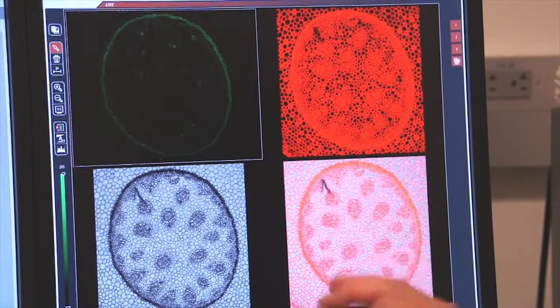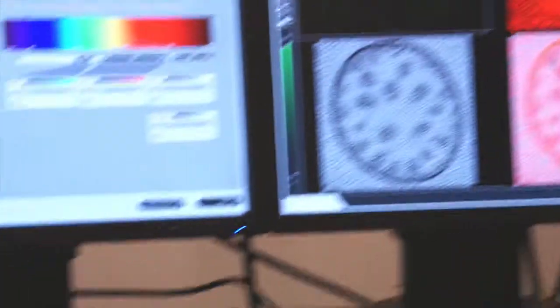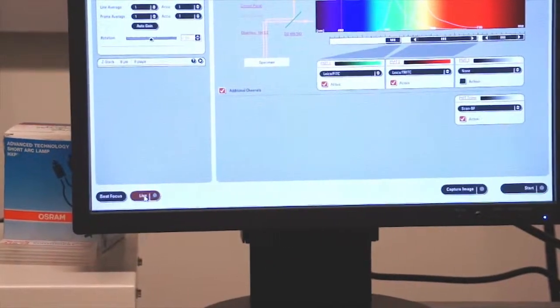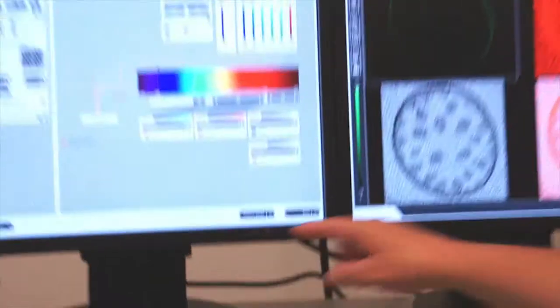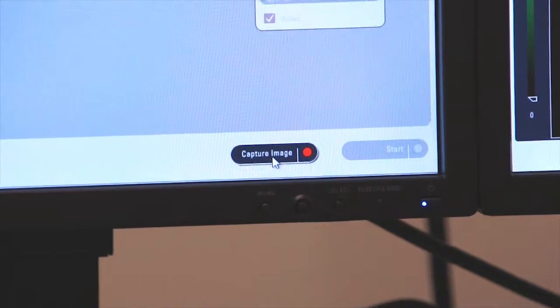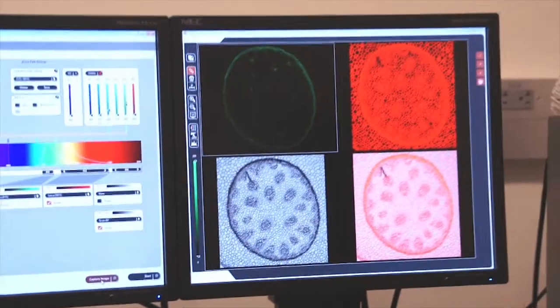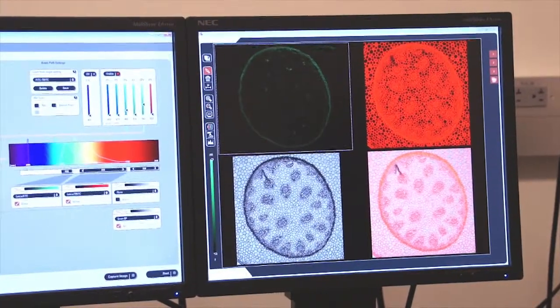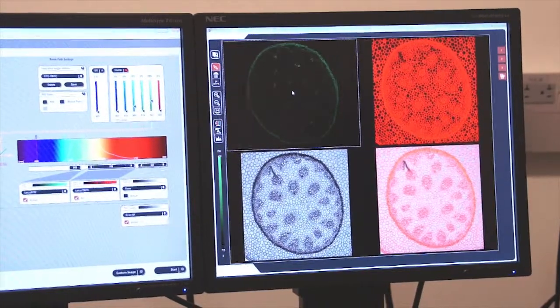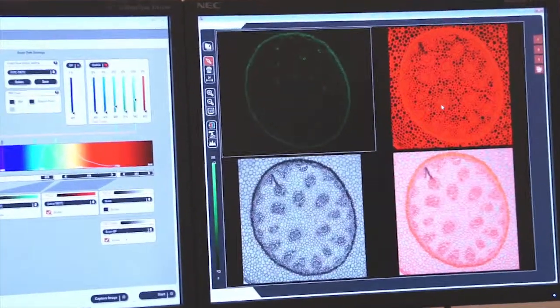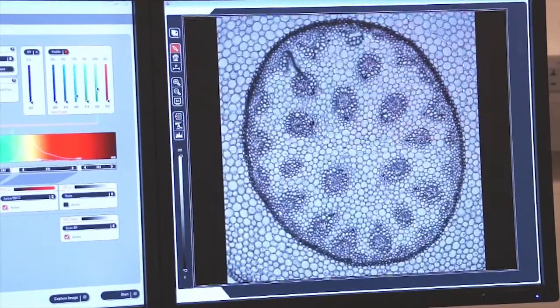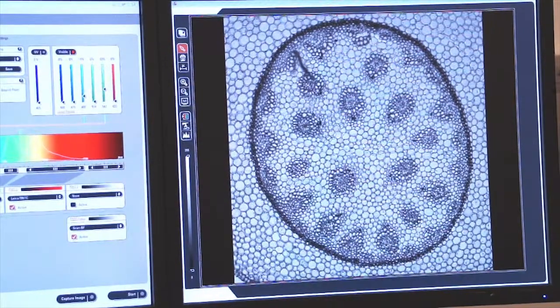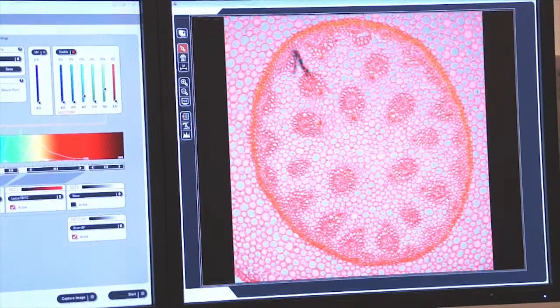If I want to capture an image then I press stop turning off the live image and then I come over here and I press capture image. And this will now capture an image with each one of the photomultiplier tubes that have been turned on. Here you can see my PMT1 image, my PMT2 image, my PMT3 which is my transmitted light bright field and my composite image.